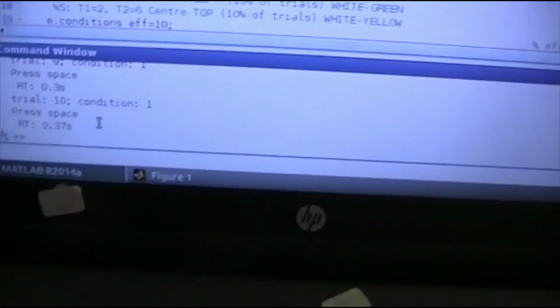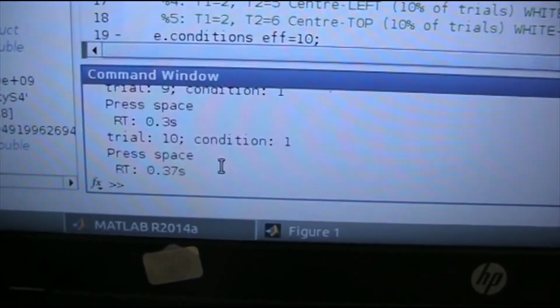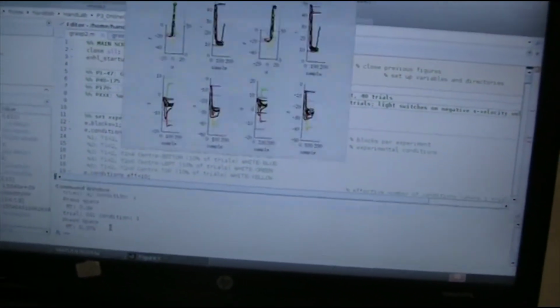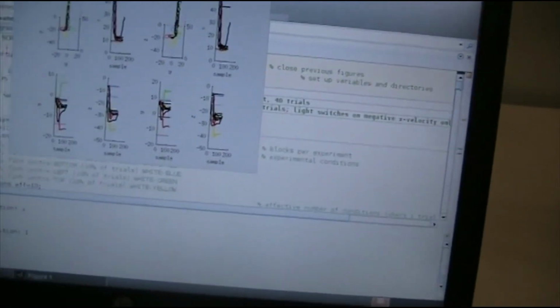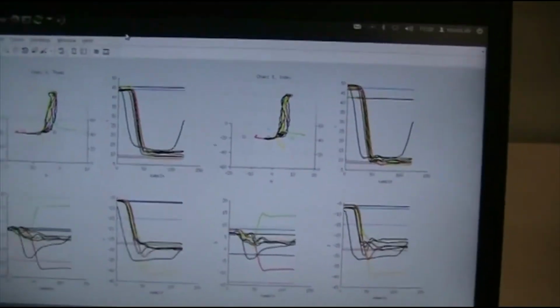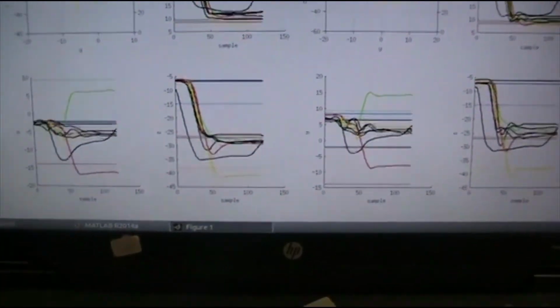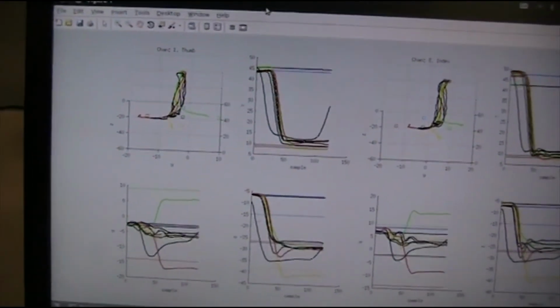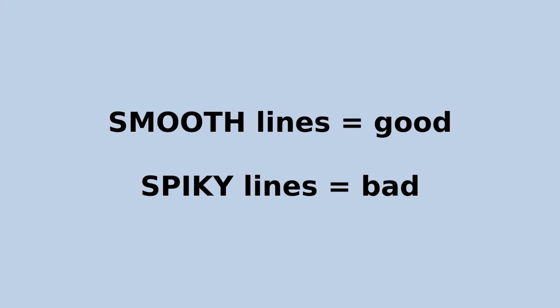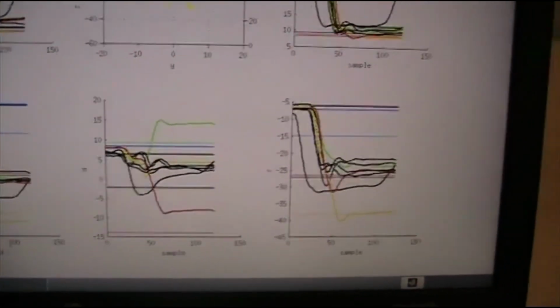The good thing about analysing the data online and immediately is that you can check it's OK during recording. You can check the reaction times and have a look at the shape of the movements as well. Raw position data of the 2 channels are shown on the graph for X, Y and Z directions separately. And you're looking for relatively smooth, uninterrupted and nice looking data. So if your data are good and clean, there should be no sudden spiky movements in the data. The lines should look smooth, not changing position abruptly.